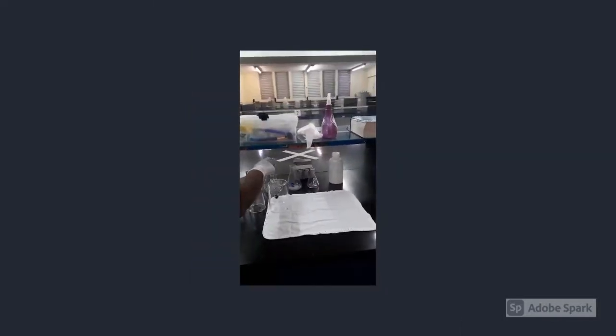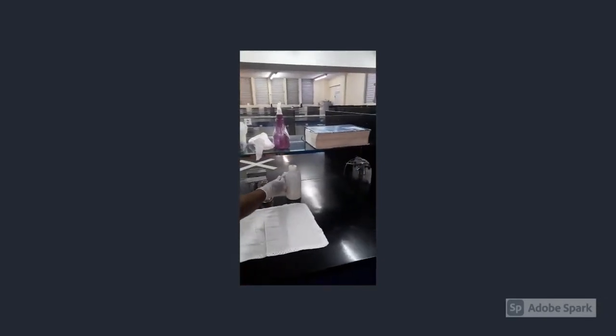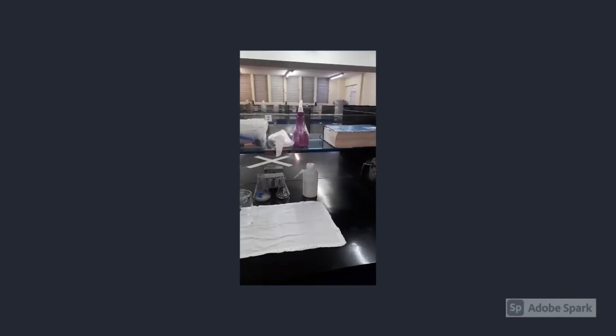Conical glass. We have 250, 500, and 150 mils. And last but not least, our wash bottle that we use for distilled water that you use to make your product.